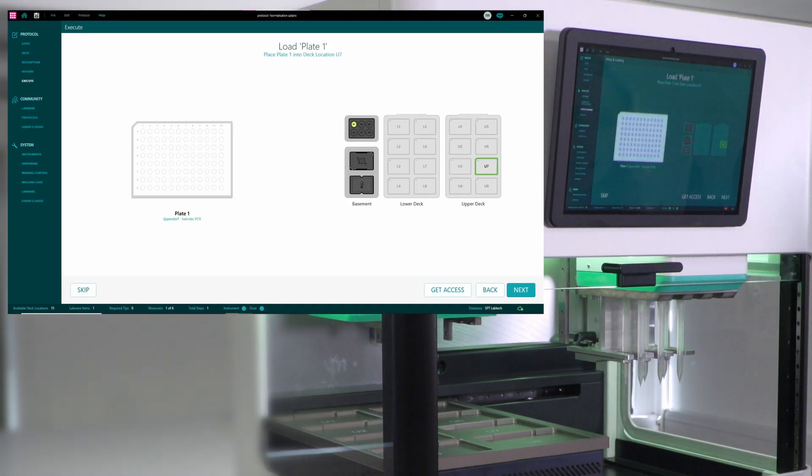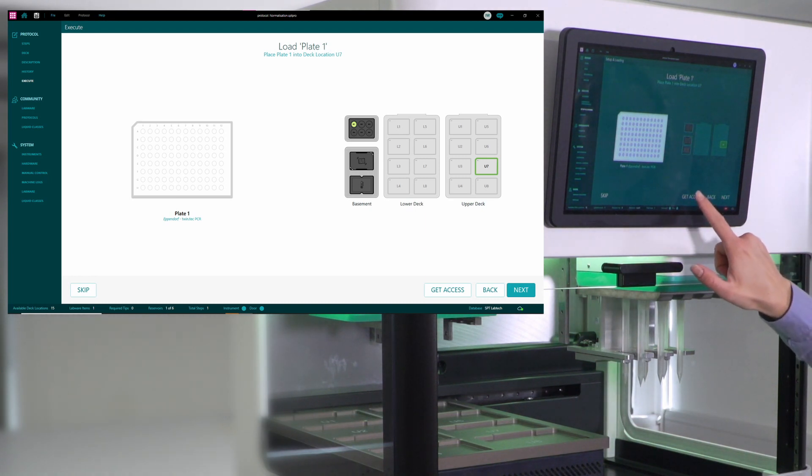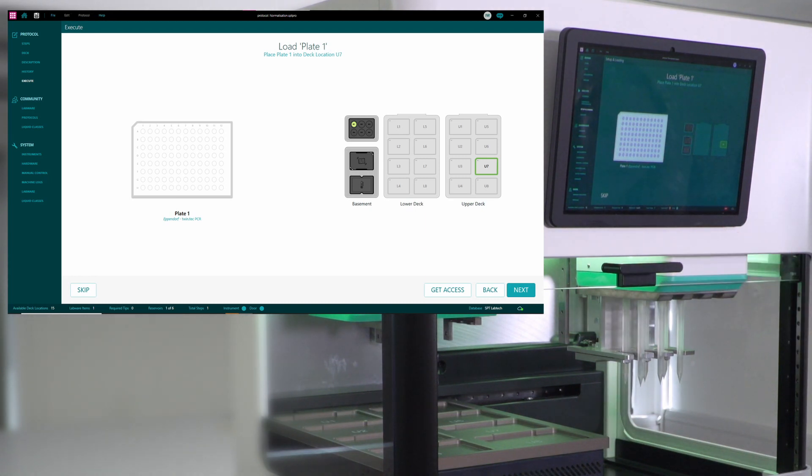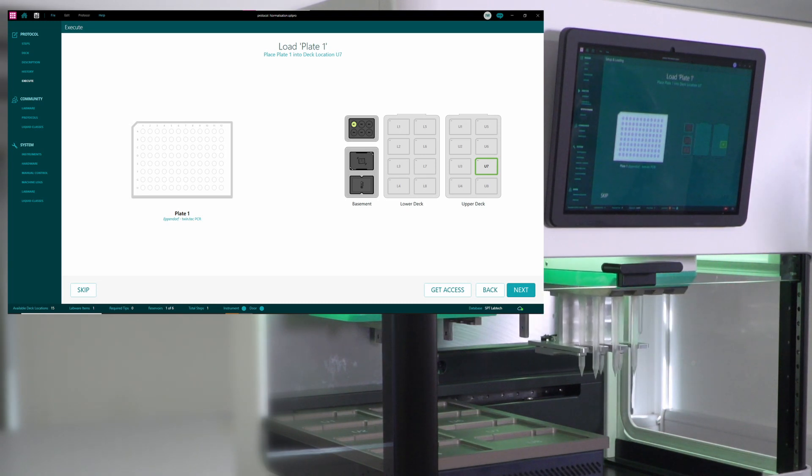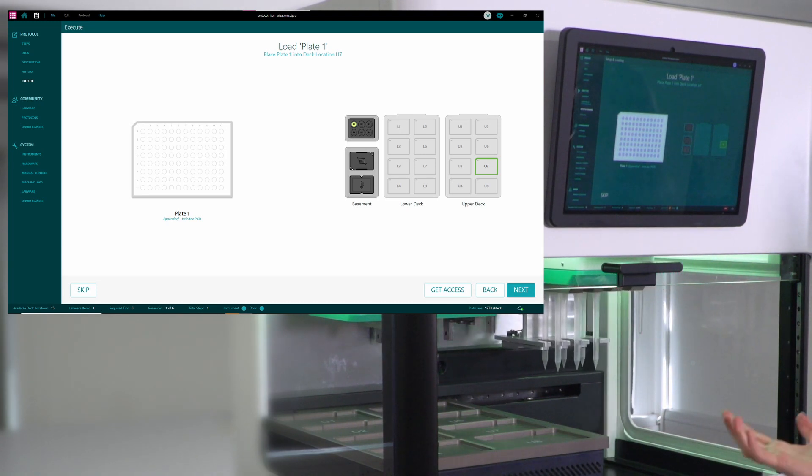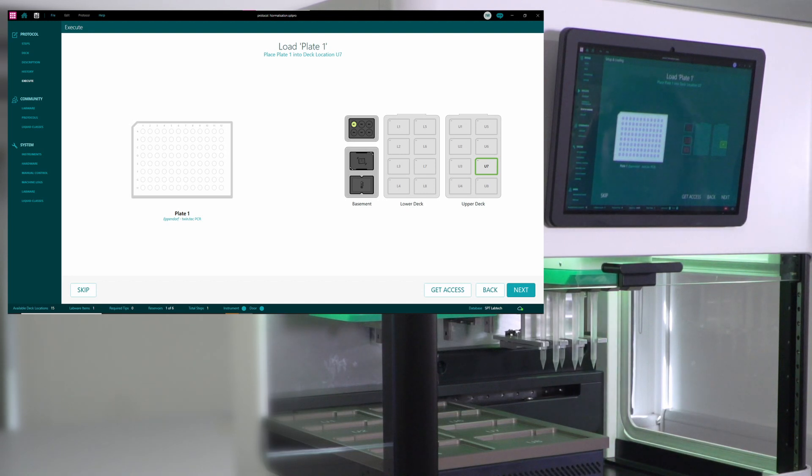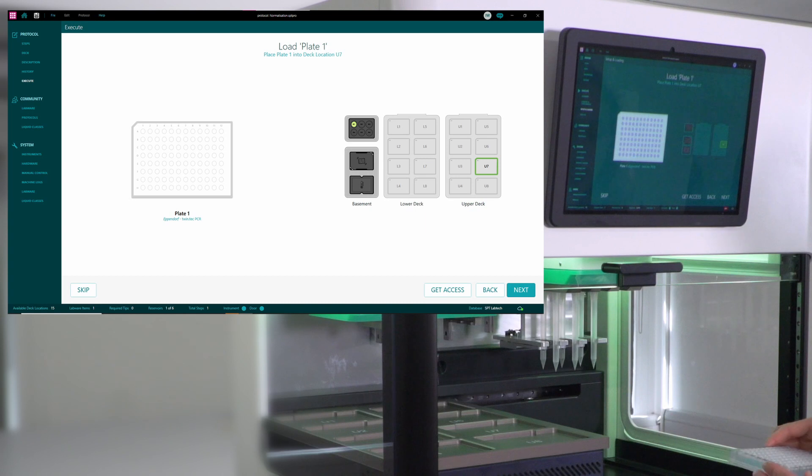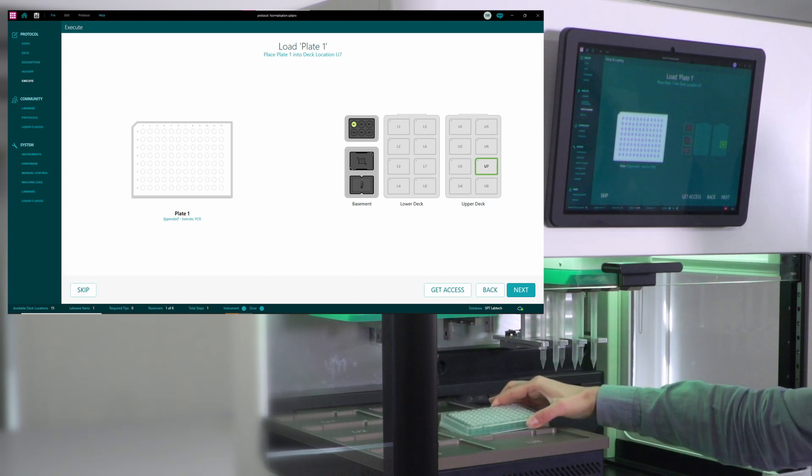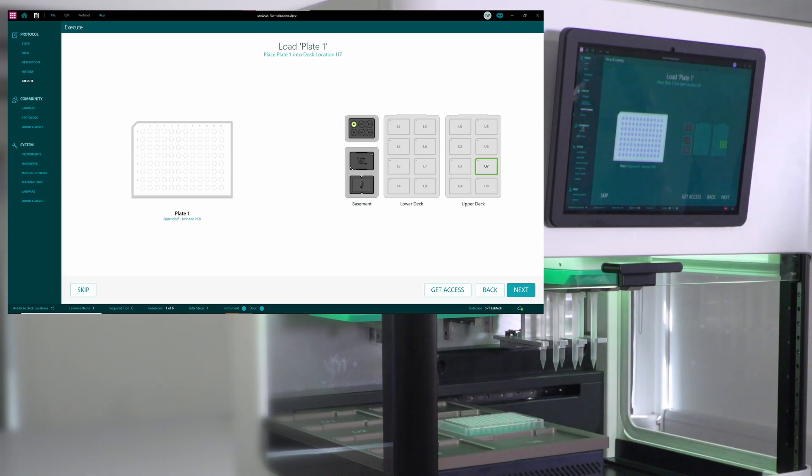And next, I need to load my plate. This is my sample plate. So I can press get access in order to have the deck in the most optimal position for loading the labware. So here's my plate with the samples, and it goes into position U7 on the upper deck.